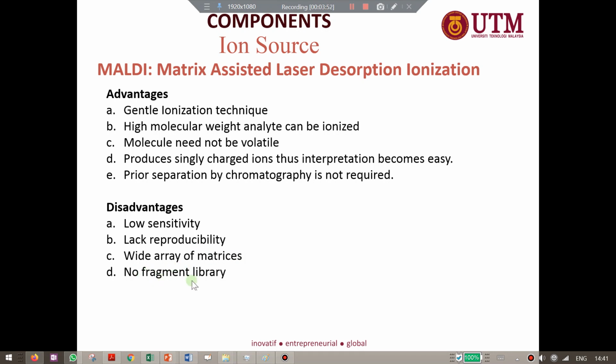we actually cannot obtain a very good library, because we don't have the fragment library. We know that the same charge, the same molecular mass, or the same mass to charge ratio can represent multiple kinds of compound. It is not necessarily that one particular compound has only one molecular mass. Compound B can have the same molecular mass, compound X can have the same molecular mass. Because the fragmentation is not that great, we cannot produce a good library for the multi MS.